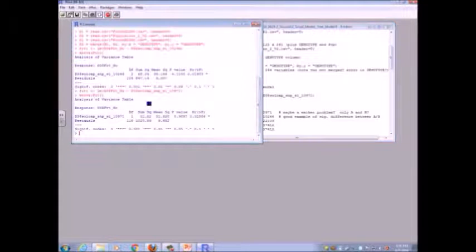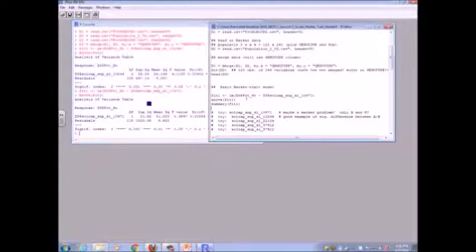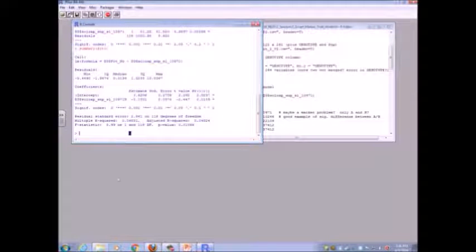When I look at this, well, that looks interesting. So it's also possibly associated. But let's go ahead and look at that summary. And when I do the summary, I see this kind of uh-oh. I don't have 3 allele classes. So there's something wrong with the segregation of this marker, so I might have to go back in and look at that marker a little more carefully.